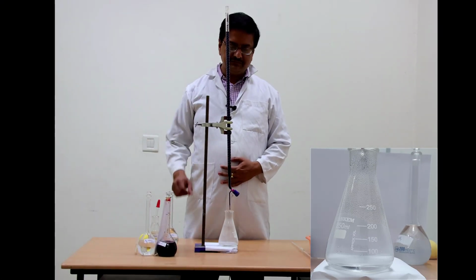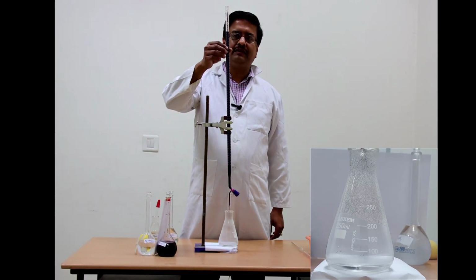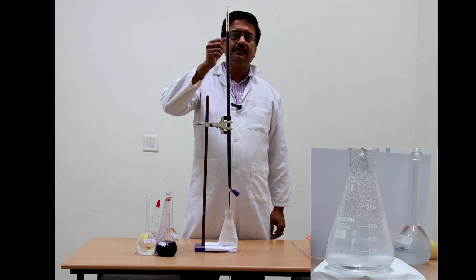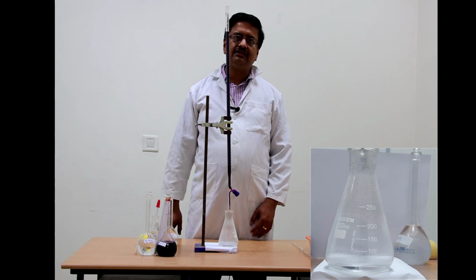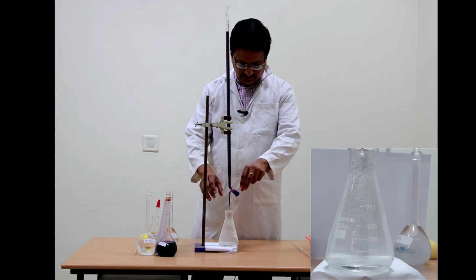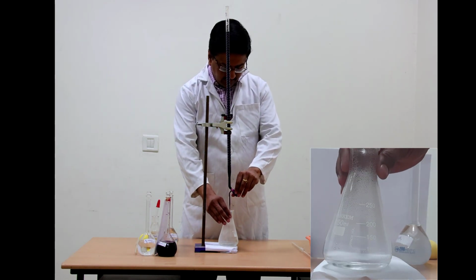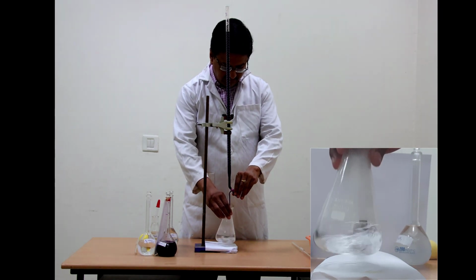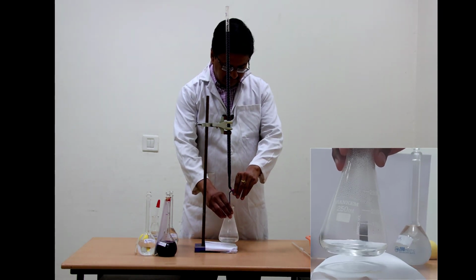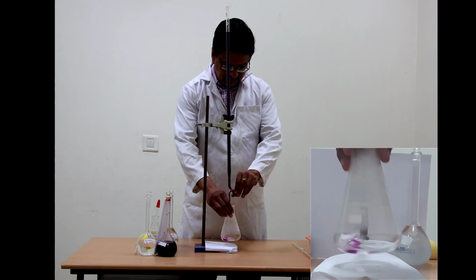So now we have filled the burette with potassium permanganate, and we have made sure that the upper meniscus is touching zero, and we have the heated solution below this burette, and we will start titrating with potassium permanganate. Let us see what happens when we drop the first drop of potassium permanganate into this hot solution.